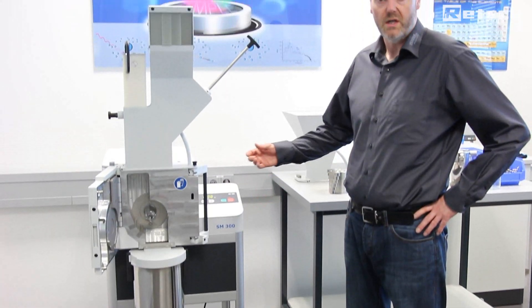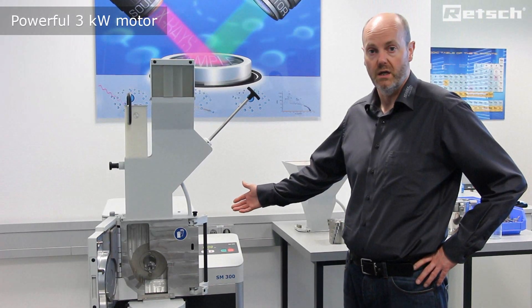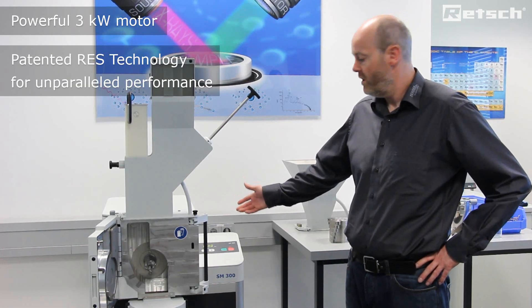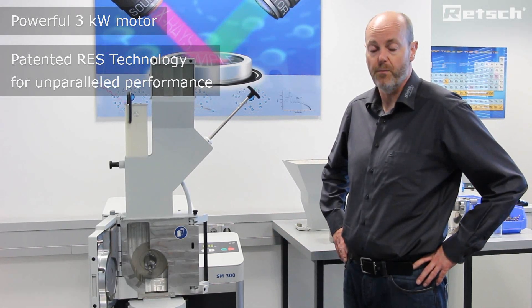The instrument is supplied complete with a 3kW motor with additional flywheel mass afforded to it by a patented RES technology. This delivers optimal cutting performance which is unparalleled.